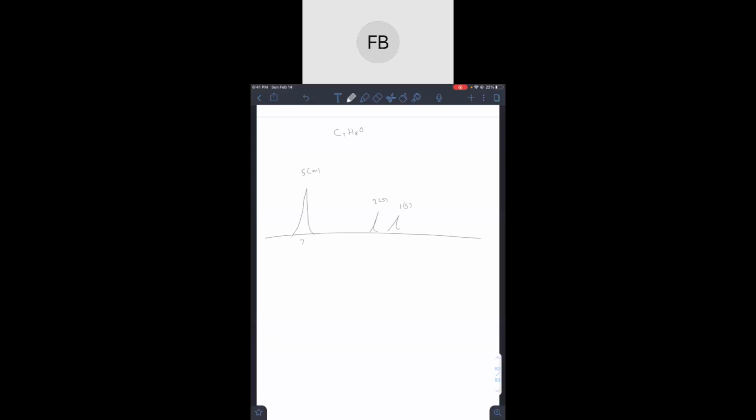Okay, this is also going to be a little bit complicated, but you'll get it. So what do I do first? Okay, so we find the degrees of unsaturation. Yeah, but that's not really necessary because we already have this peak here. And so we know something very important. What do we know? Remember, it's at 7. What, that there's 7 carbons? No, it's on 7 along the x-axis. Oh, okay.